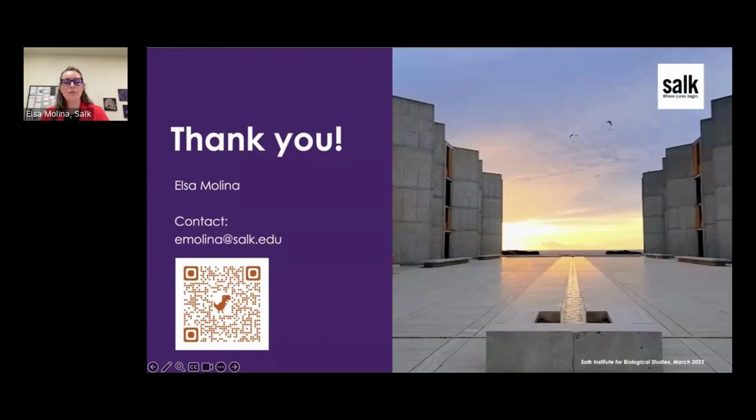So these are two different technologies, and you get different answers from single-cell RNA-seq and spatial transcriptomics, or single-cell spatial transcriptomics. So the best way is to talk directly to the core manager or the core director, or the person who knows about the technologies and who knows the difference, and discuss fully your project with this person to determine if you just need single-cell RNA-seq, or if you need spatial single-cell transcriptomics.